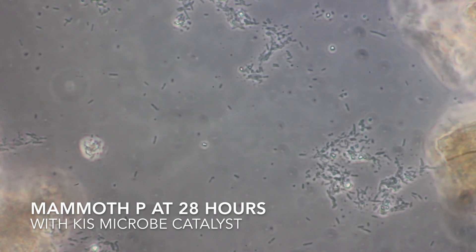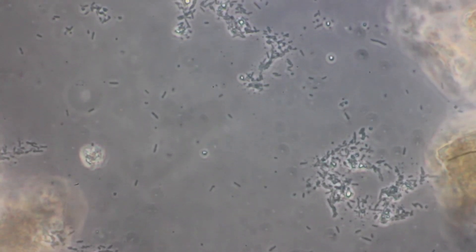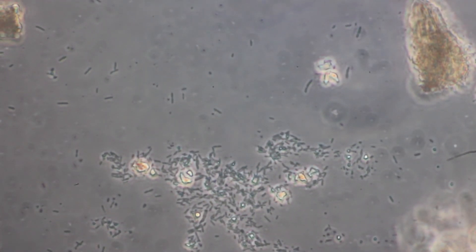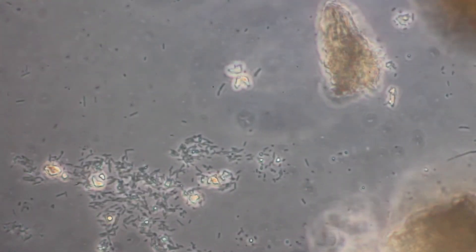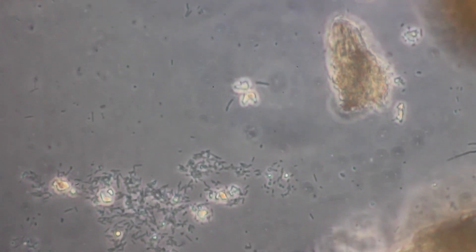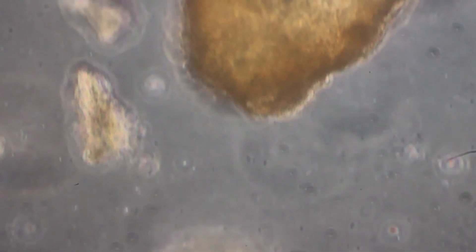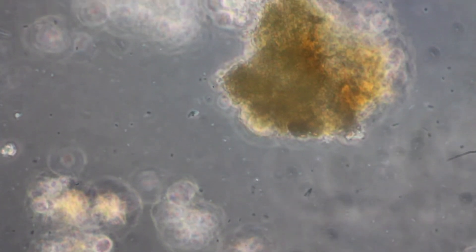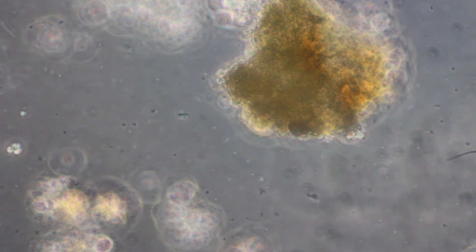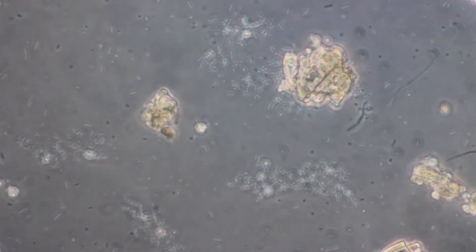We're back with the Mammoth P and distilled water with the microbe catalyst at around 28 hours. We're seeing a lot more bacterial biomass, and a lot of it is starting to cluster around certain parts of the microbe catalyst — some of the organic matter. This appears to be a pretty good food source option for at least some of the bacterial species in the Mammoth P. I'm seeing some morphological diversity, but maybe not quite as much as in the original sample, which may lead me to believe that not all of the phosphate-solubilizing species are being multiplied. But I think it's definitely worth a shot and a great way to possibly extend your Mammoth P a little bit further.